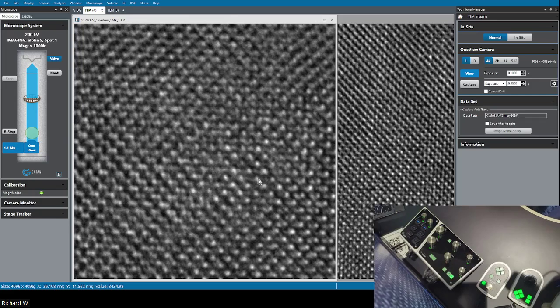Okay, so are there any questions about the thin film high resolution TEM? NTU students, any questions? There is one question from UNSW. Oh, yeah. Sorry, Charlie. Is it the atom in white color?